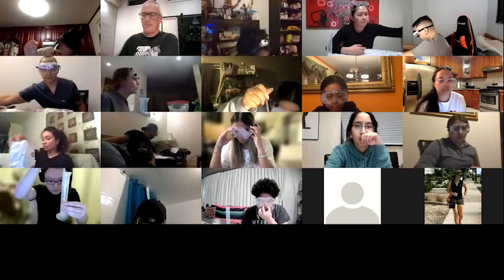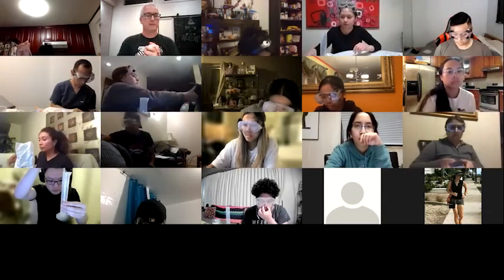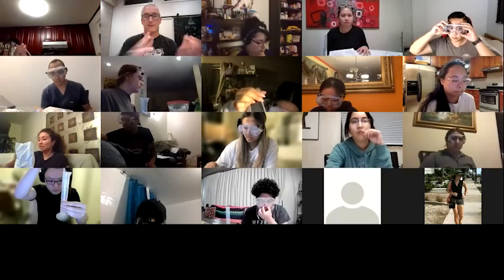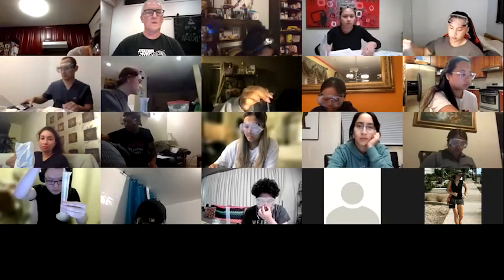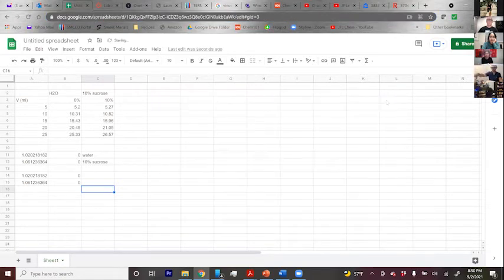So while you're making solutions or not making solutions, figured I will go over how to handle the data that you've collected. So we'll go back to Google Sheets, which is what we used last time. So here's Google Sheets. Here's my data from last night. So I'm going to just get rid of this and basically show you how to put the data in.